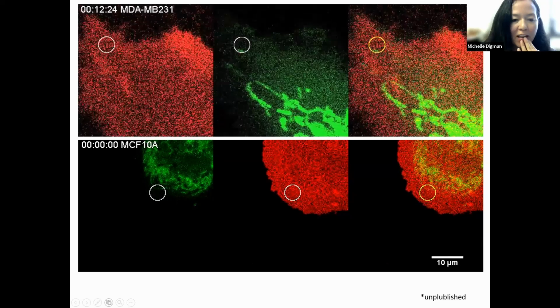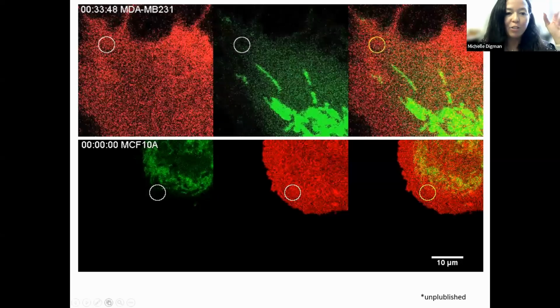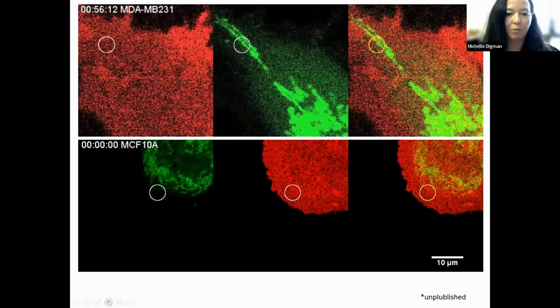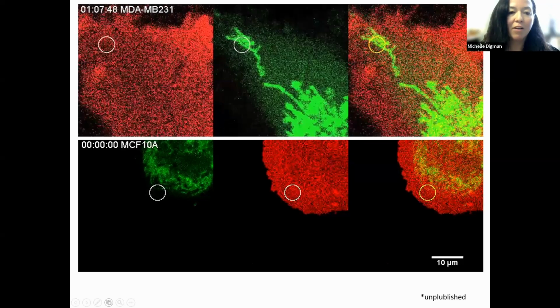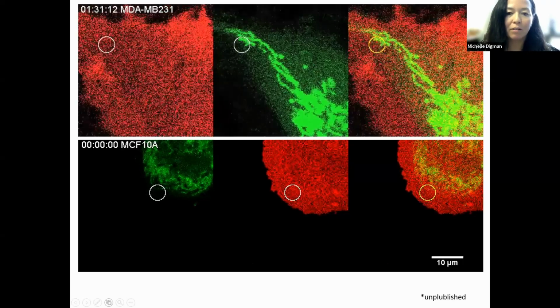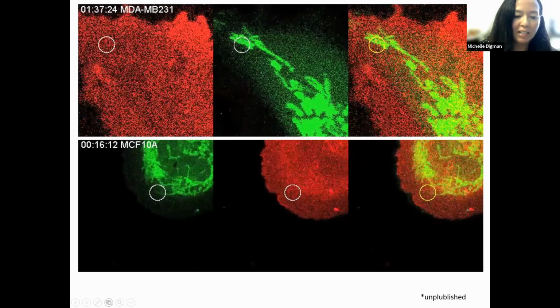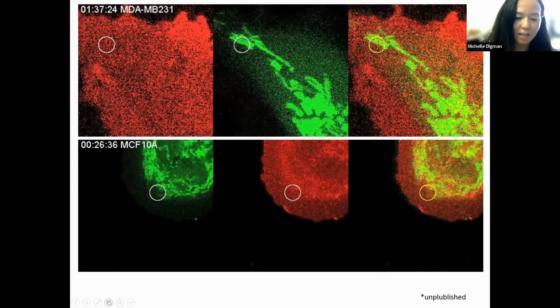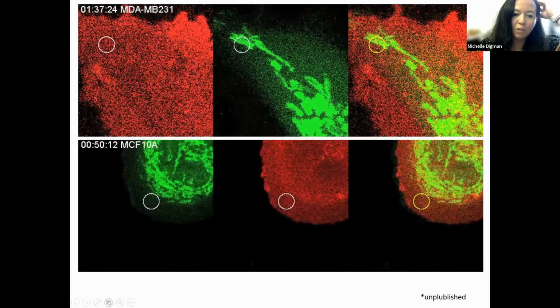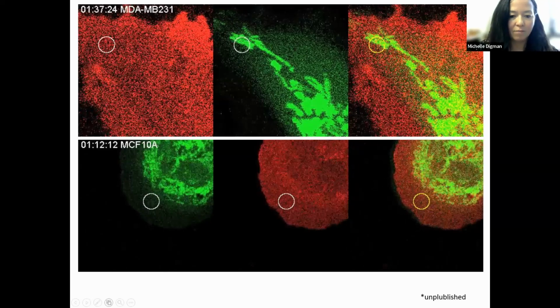to look at mitochondrial transport. And by photoactivating RAC, with this really ingenious way to do it, you can actually have the cell go in the direction that you want. And so here what we see is that when we photoactivate this part of the cell, we do see a preferential recruitment of mitochondria to these leading edges. And we did these on MB231 cells, these are the triple negative, highly aggressive tumor cells, and in MCF10A cells, a non-tumor cell type. And basically, we don't see any preferential recruitment of mitochondria to these leading edges of the cell.